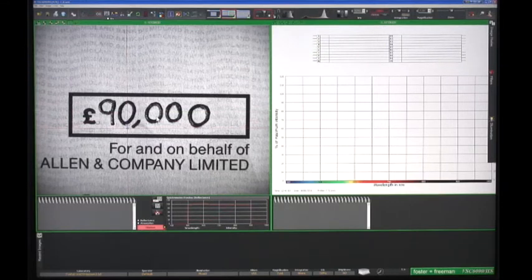Alternatively, we can click on the image to reposition the crosshair. At any time, we can copy the preview graph to the main spectrometer graph by clicking this button and giving the spectrum a title. Similarly, we can copy the spectra of many other points. If you prefer to see absorption spectra instead of reflectance, click this button and the preview will now show absorption.